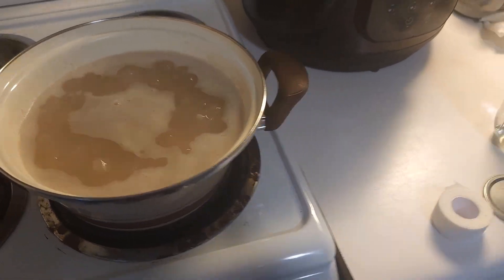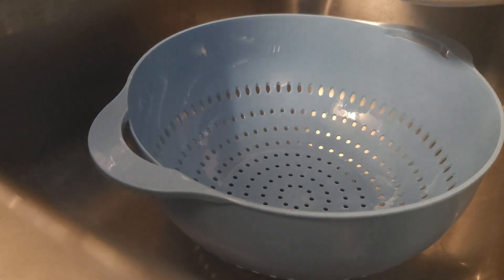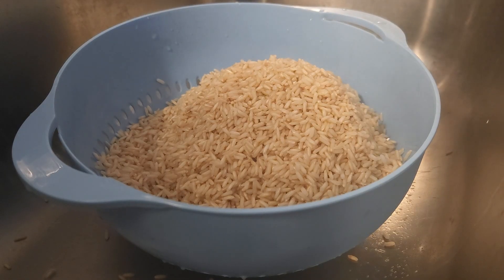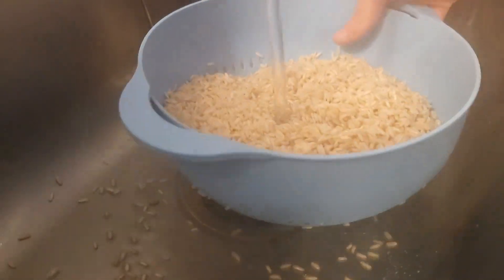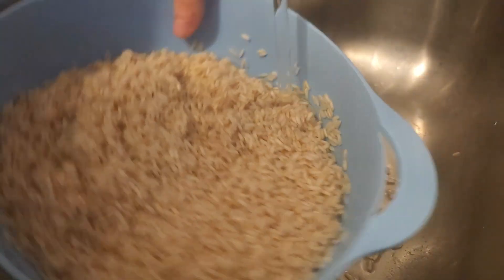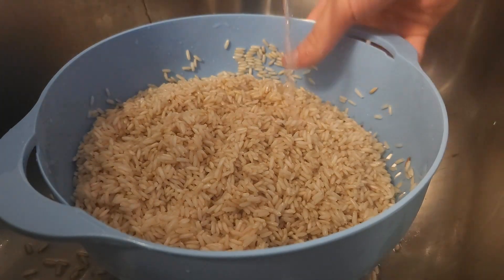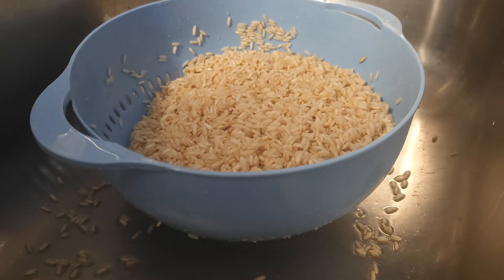With the rice finished, we're going to go ahead and remove it from heat and move it to the sink to drain all of the rice. Now we're going to rinse the rice with cold water to stop the cooking and wash all those starches off. We'll go ahead and leave the rice here to dry for the next 15 minutes.